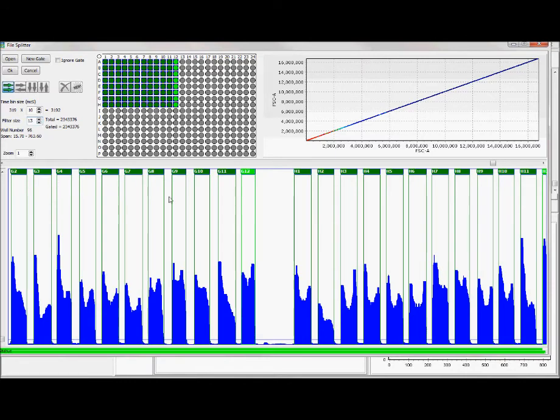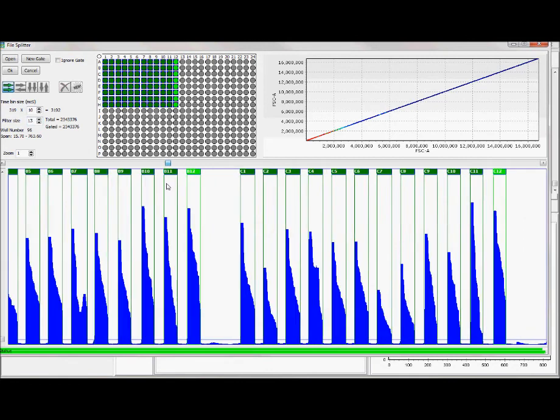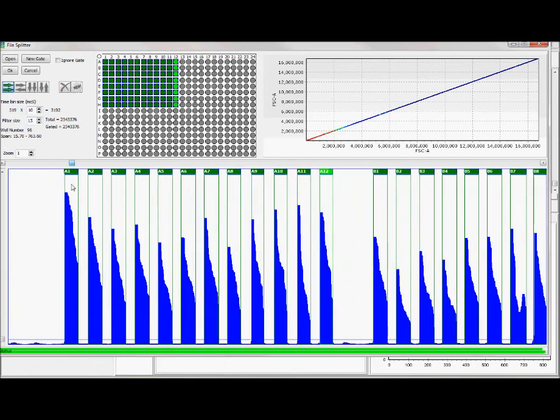Then you can see that we have a fairly clean looking data set. So that's a very clean looking data set.